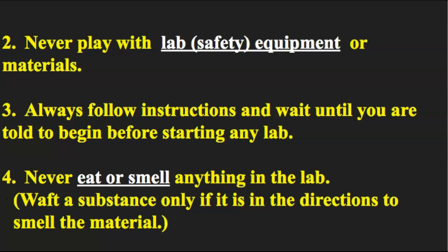Number 4, now remember in part 1B, we said you shouldn't be eating in the room. So number 4 should be an easy one to follow through on. Never eat or smell anything in the lab. For those of you who had this in science classes before, you should understand what wafting is. If you do need to smell something in the lab as part of the lab procedure, we will tell you that during the pre-lab time, okay?